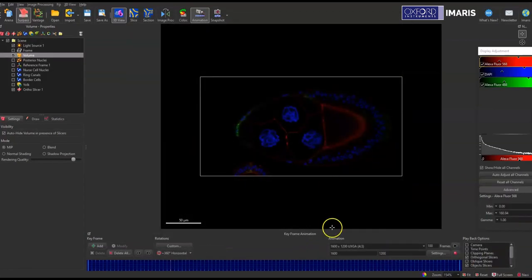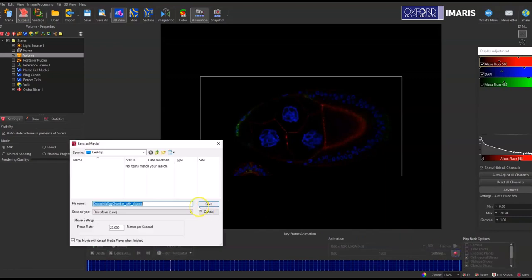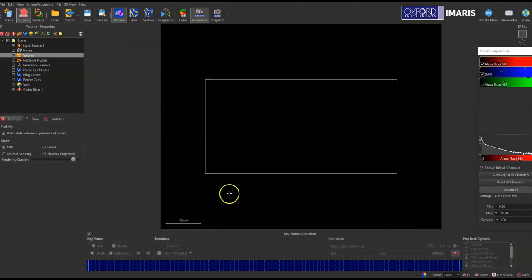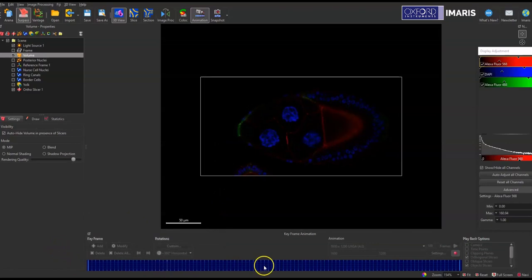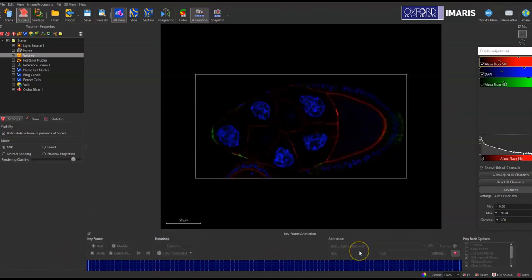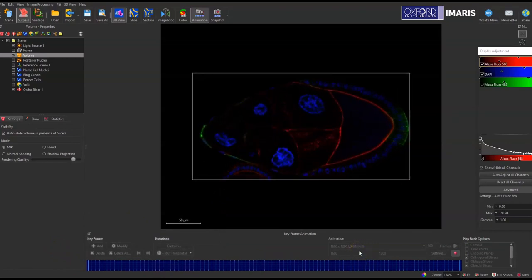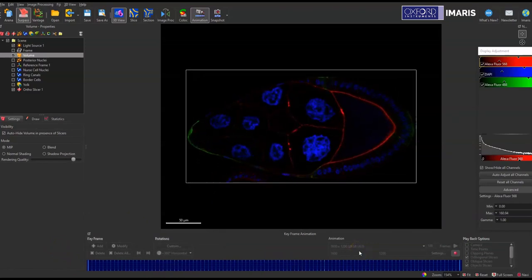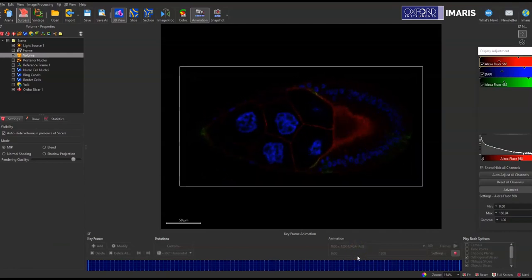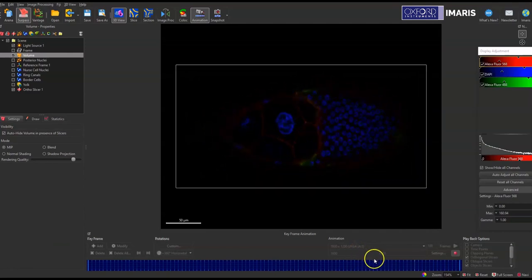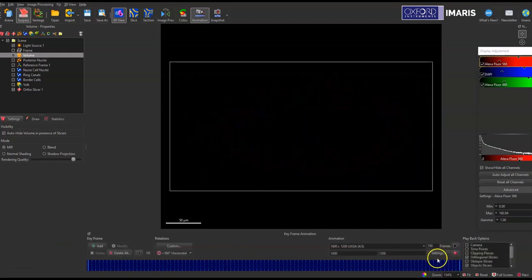But once the recording is ready to go with the key frame setup as I would like, I'll just hit the record button and it will quickly record the video moving through the key frames and it'll create either an mp4 or an avi file, whichever you would prefer in the save settings when you're selecting that record button.